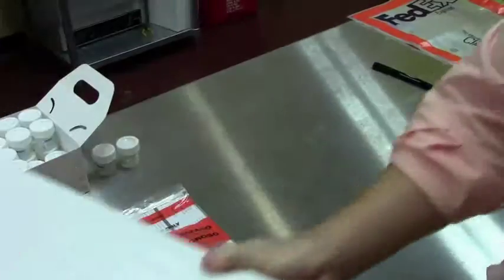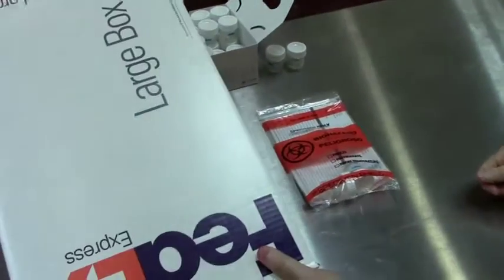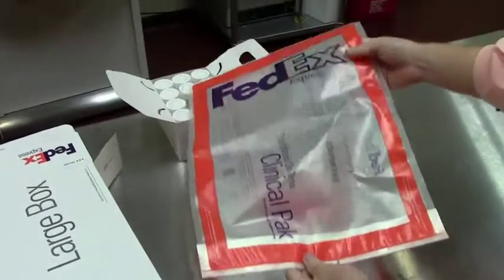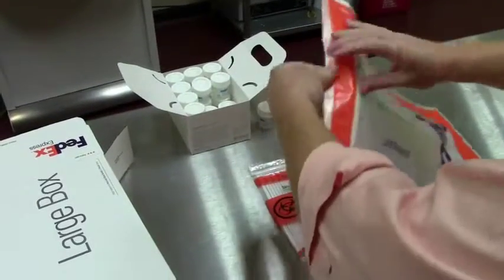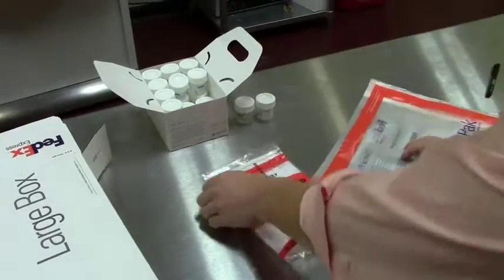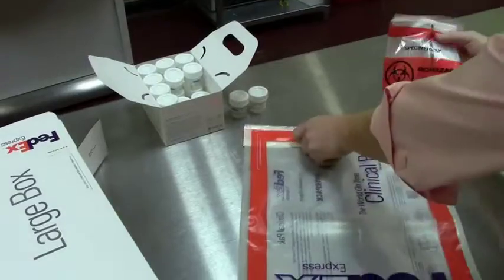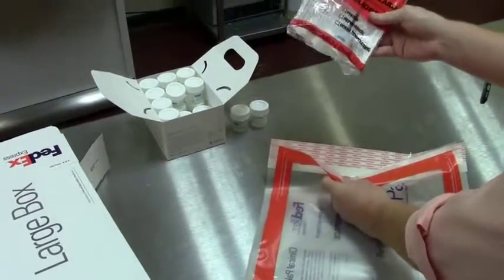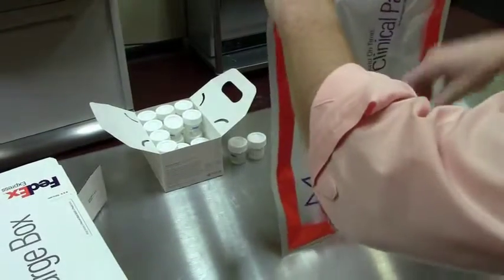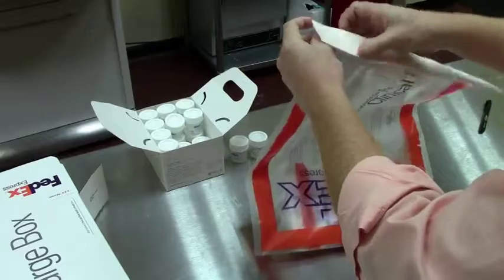Now once they get in the bag, there's two things that we do. We have a FedEx Express box and a FedEx clinical pack. OSHA requires a two-way barrier to ship supplies. One is the biohazard bag, two is the clinical pack. So if you have 10 of these, you can put 10 different ones or more in each bag. Get all those in there as many as you can, and then you just seal this package up.